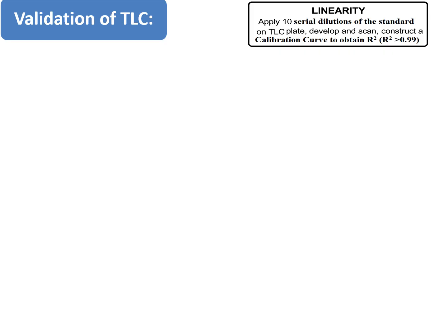In simpler terms, as the amount of the analyte increases, the response, such as the density of the TLC spot, increases in a straight line, linear manner.